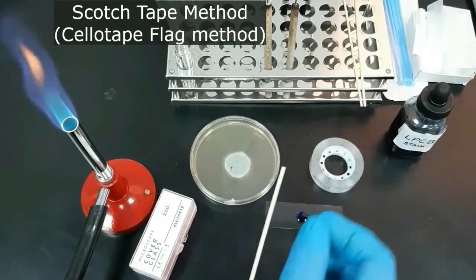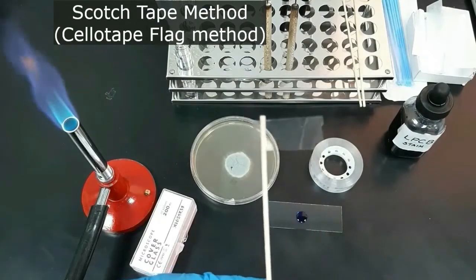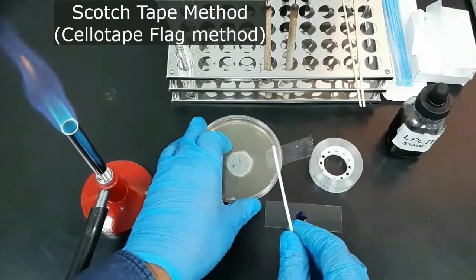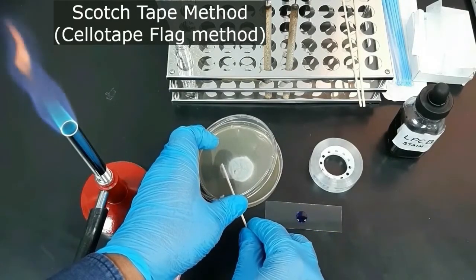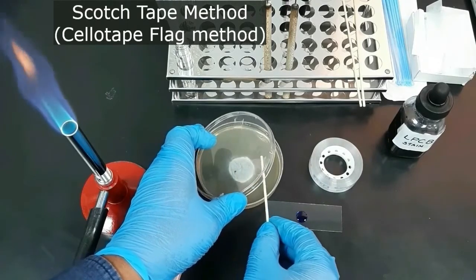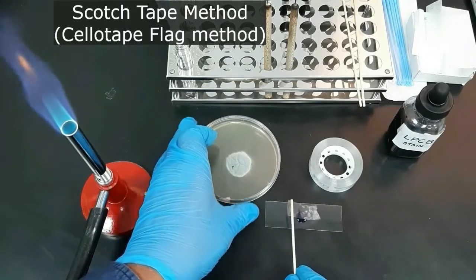Cut a strip of transparent scotch tape and stick one end of the tape to a wooden mixing stick so it looks like a flag. Then open the culture plate and touch the adhesive side of the tape onto the surface of the fungal colony, and then place the tape over an area on the glass slide containing a drop of lacto phenol cotton blue stain.